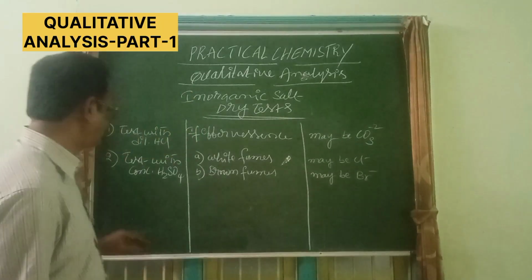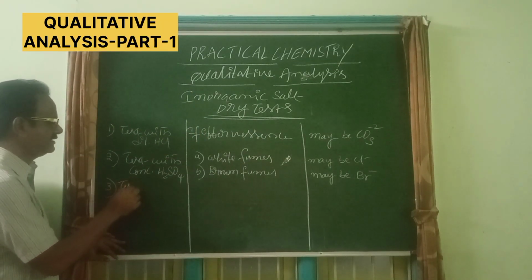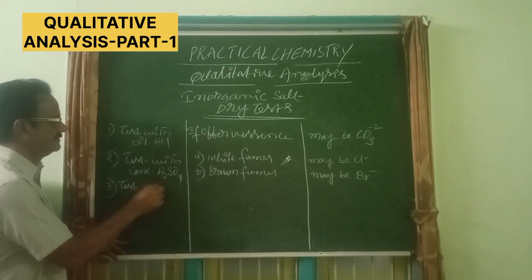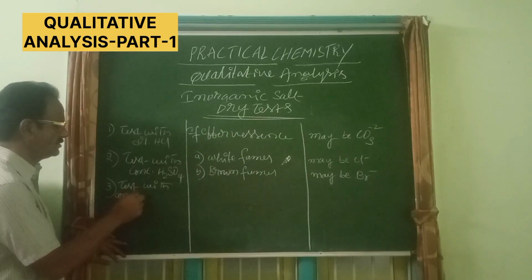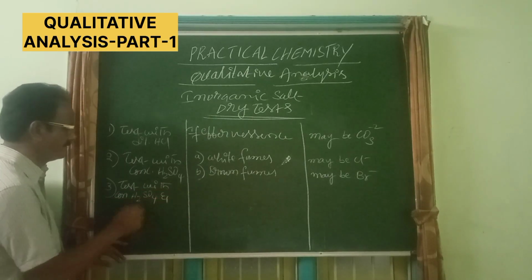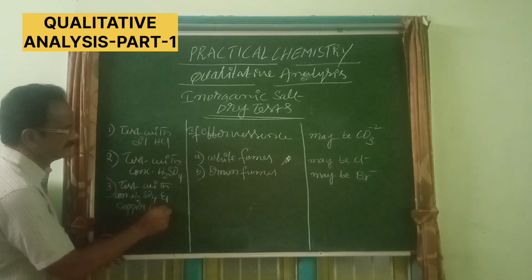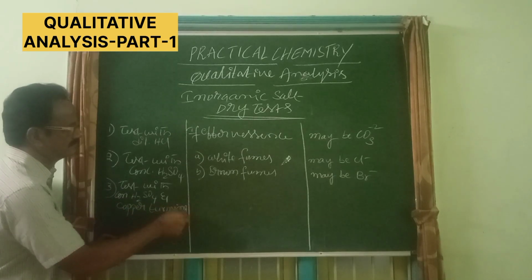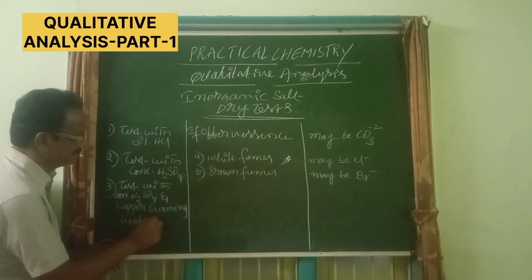Okay, next, the third one. Test with concentrated H2SO4 and copper turnings, heating.